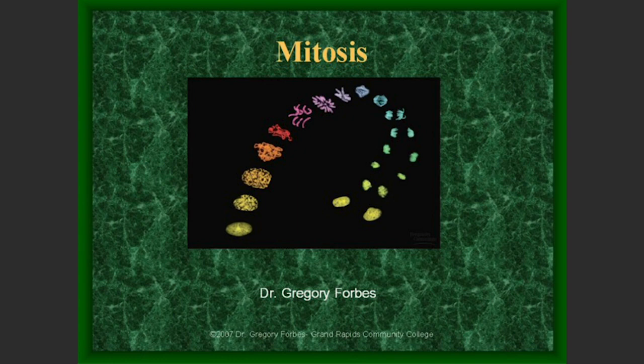Because our goal here is to really have you spend some more time practicing with the microscope by looking at these slides. And also remember, part of the other SPOs for this lab is to have you be able to identify different cell features. You've had a chance to look at red blood cells, human sperm, and cheek cells also, but in those cells you're unable to see chromosomes or any spindle fibers. Those features can only be seen when the cell is actually actively dividing, when the cell is dividing and its nucleus is replicating itself in a process called mitosis.